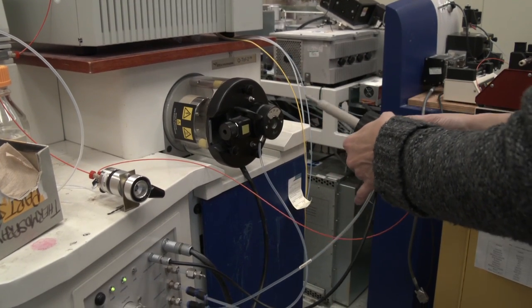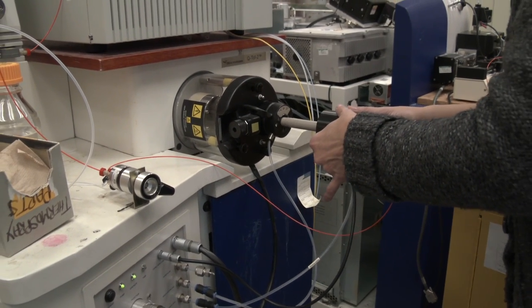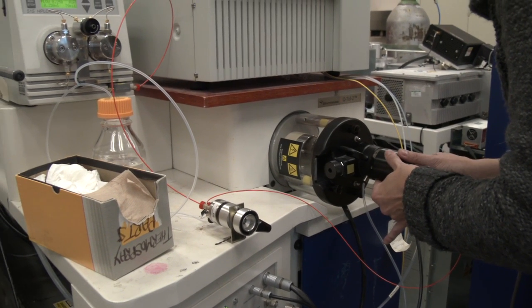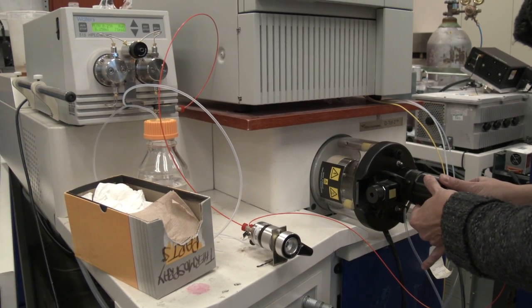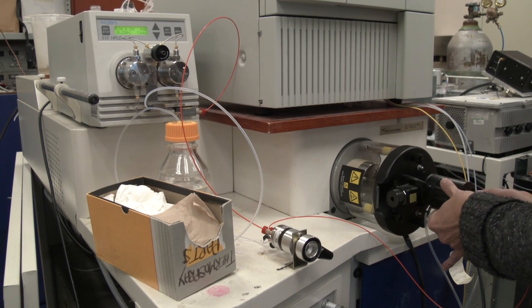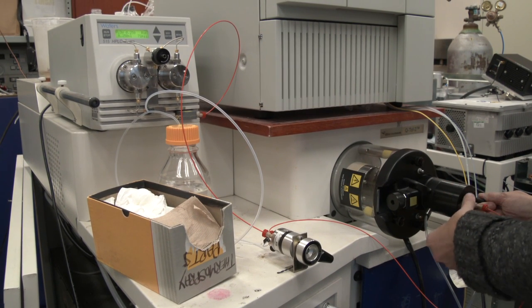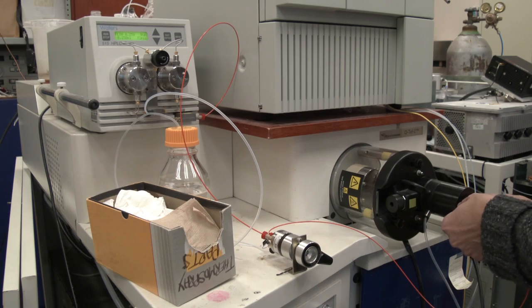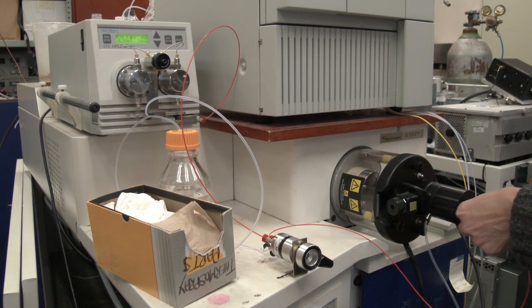The electrospray source is an atmospheric source and is outside of the vacuum system. Electrospray was first developed in the 1990s by a guy called John Fenn. The way that molecules become charged is much softer than an electron impact source, thus larger molecules like proteins and peptides which tend to fall apart under an EI source can now be studied using electrospray.